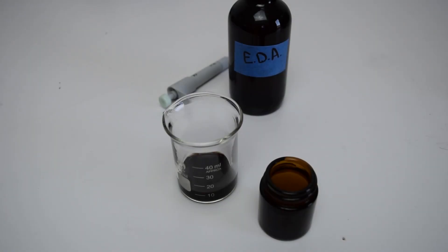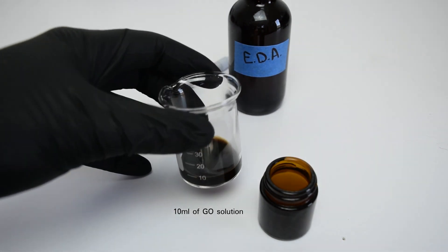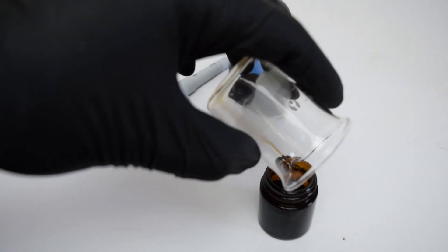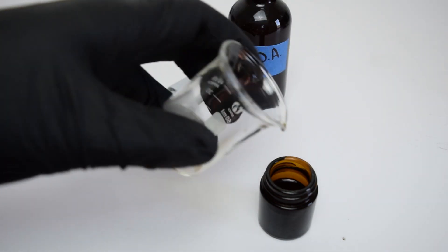Next, add the graphene oxide solution to your containers, filling them up as much as you want. Just make sure to leave some space in the container. I am testing different shapes of the aerogel so I'll be using different size containers and filling them up about a quarter to a half.